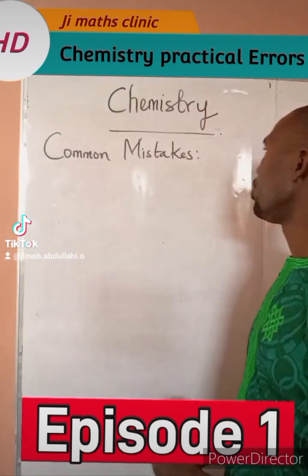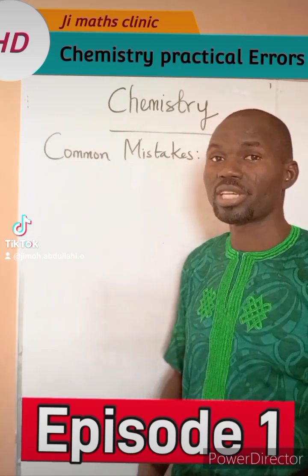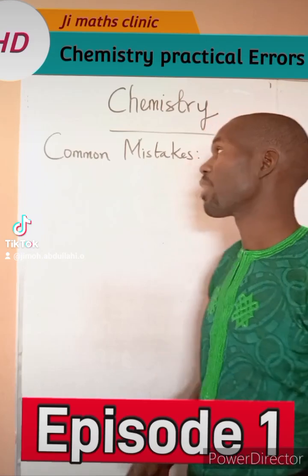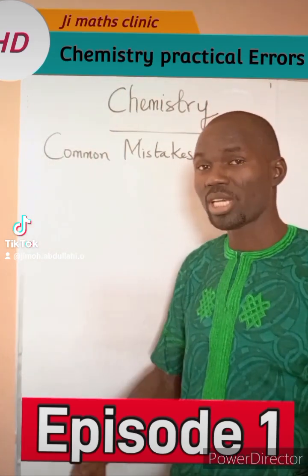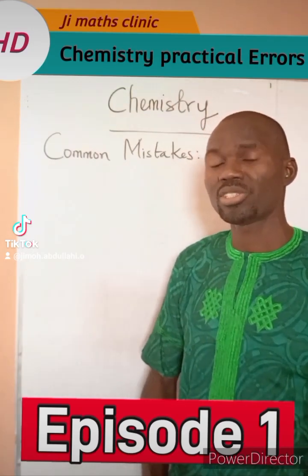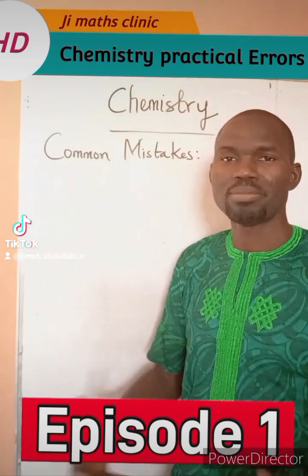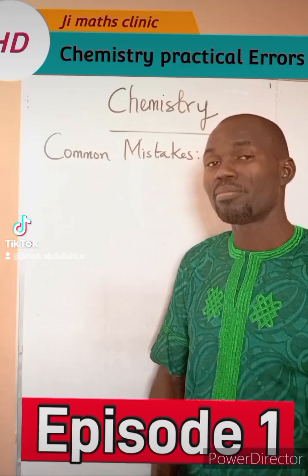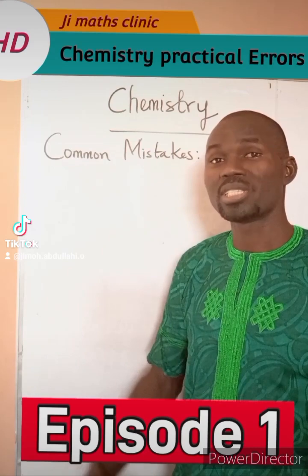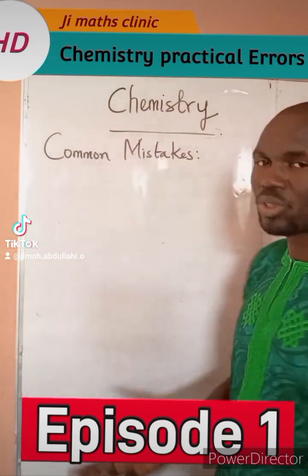In this video, I'm going to teach you the rules and regulations guiding the volumetric analysis in chemistry practical exam. There are a lot of mistakes that students make while completing their volumetric analysis table, that's the titration table. Sometimes they are happy that they have written the practical exam, not knowing that they have done a lot of things that could make them not score good marks in their exam. Now, what are those mistakes?